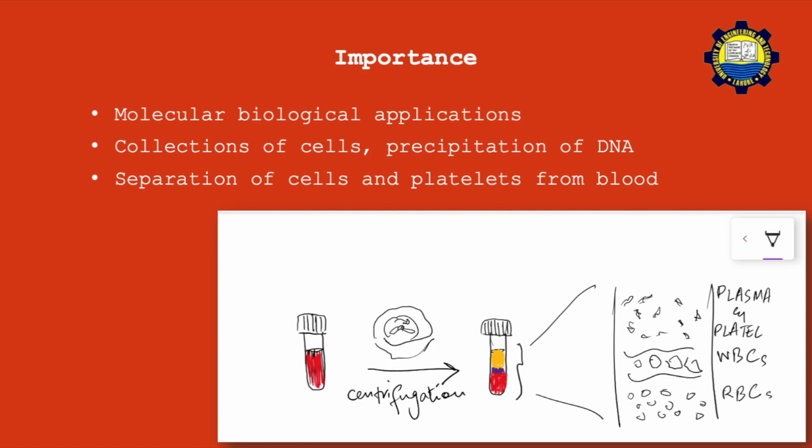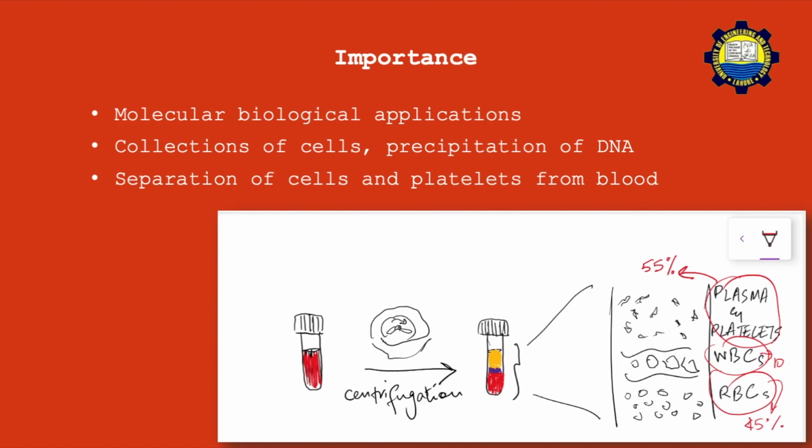As you can see in this demonstration, you have plasma and platelets separate out at the top of the vessel. And if you were further interested in separating these out, plasma and platelets, you might as well drain them into another tube and process only this particular solution and try and separate plasma and platelets as well.